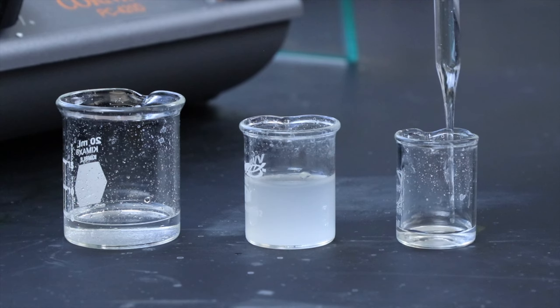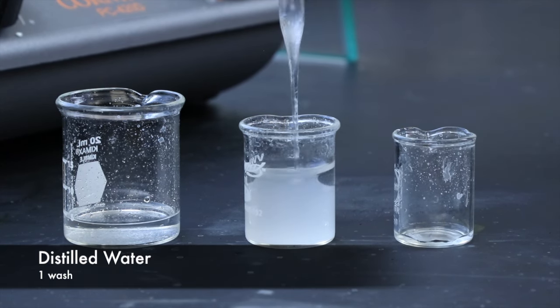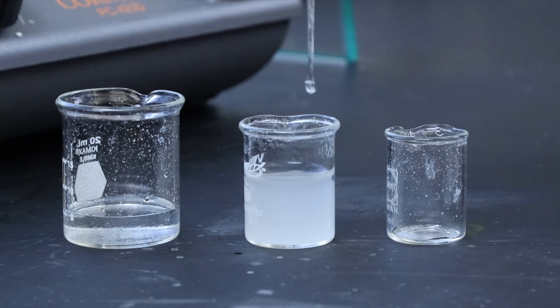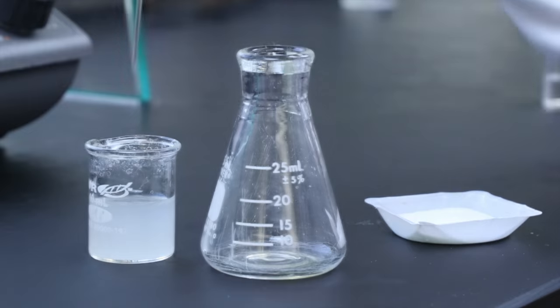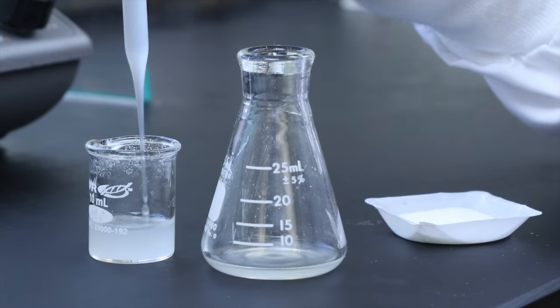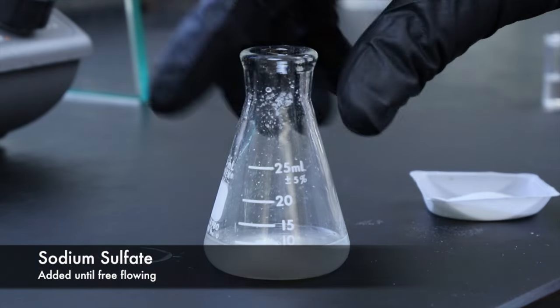And then I'll rinse the organic extracts with some distilled water just to help remove any ions that might have been left over from the bicarb washes. Now I can transfer the methylene chloride solution to an Erlenmeyer flask where I can dry it using sodium sulfate, and I'll add that until it's free flowing.